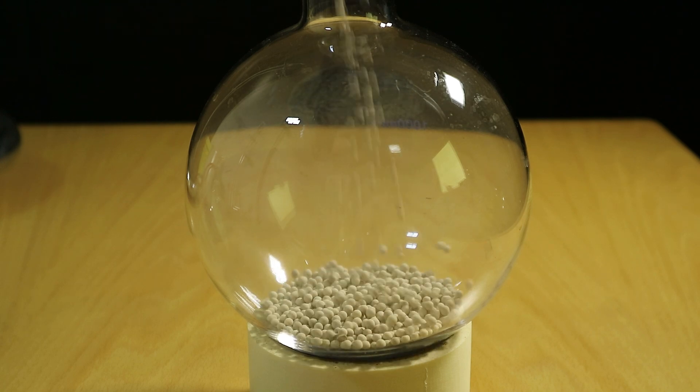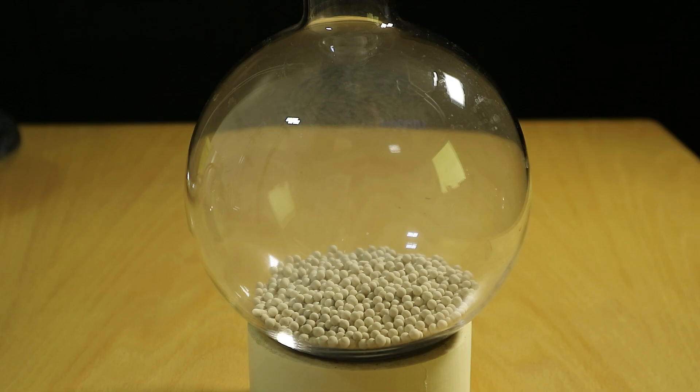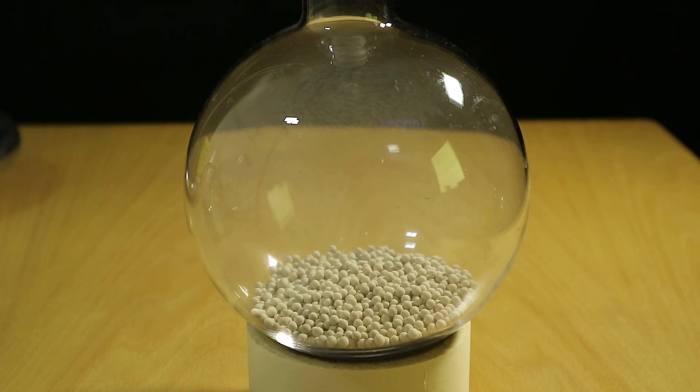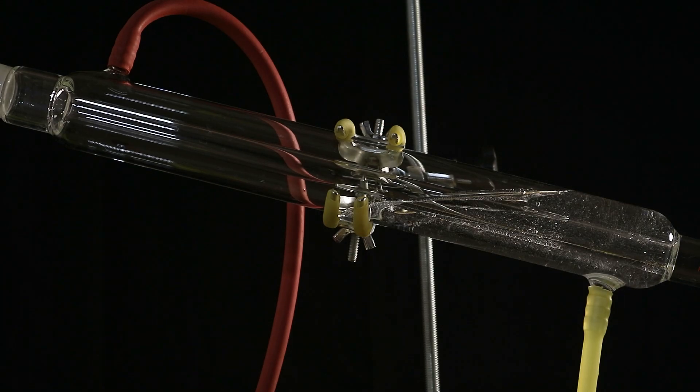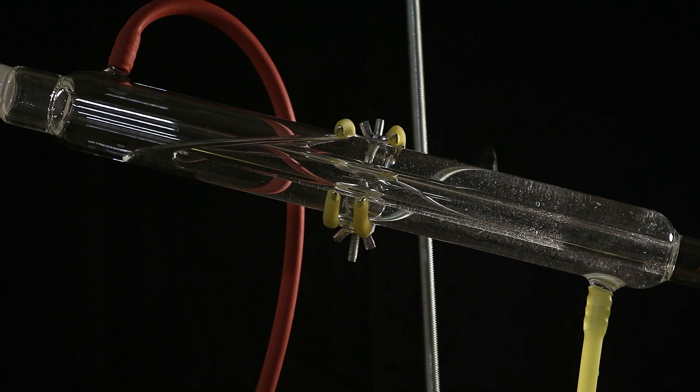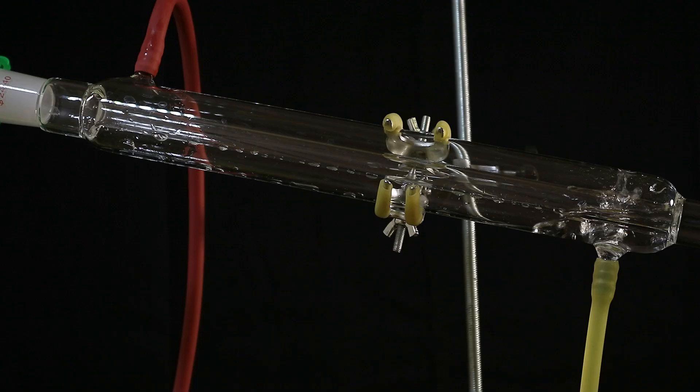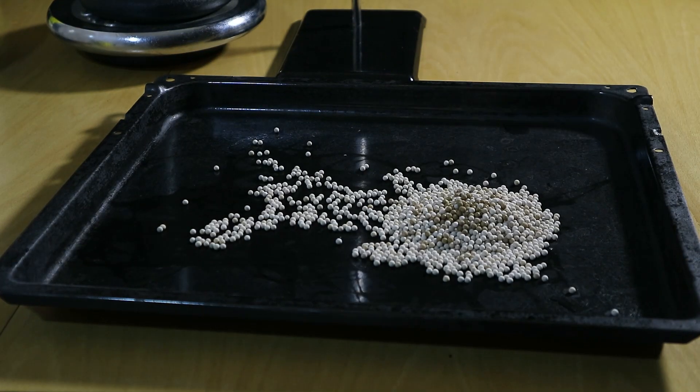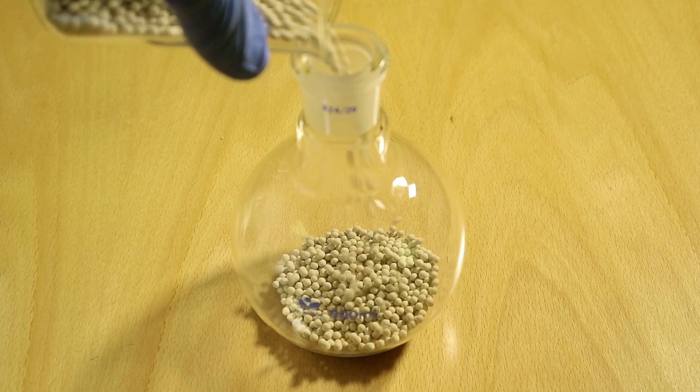I mean you could use diatomite or kieselguhr or celite or whatever it's called and it will probably work to get most of the dust out. What I opted to do was to make this back and forth switcheroo where I distilled the ethanol once over dirty but dried sieves and then distilled that over another set of dirty dried sieves and then I dried the first set of sieves again because they were wet now which decreased the amount of dust in them.